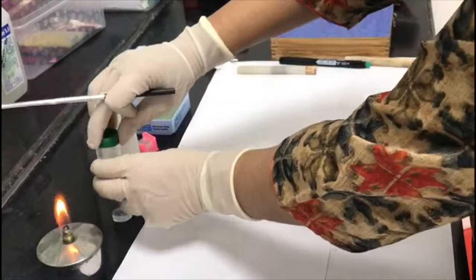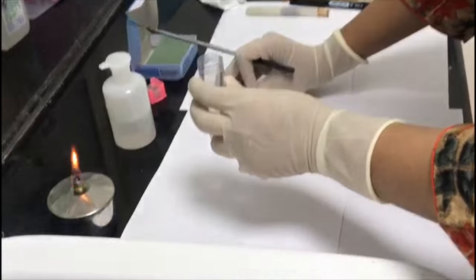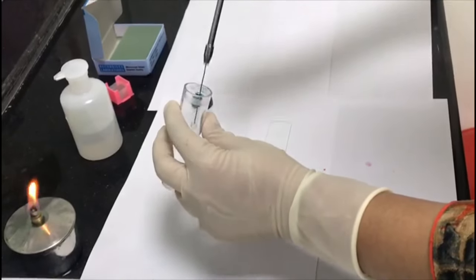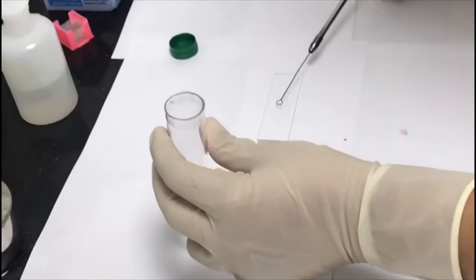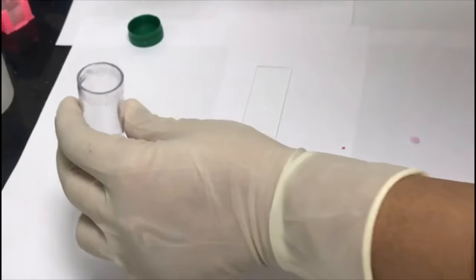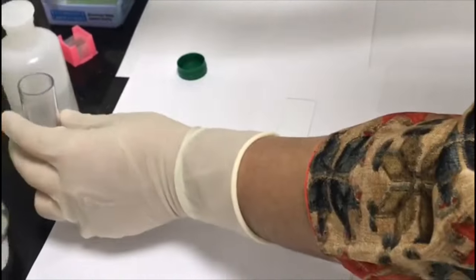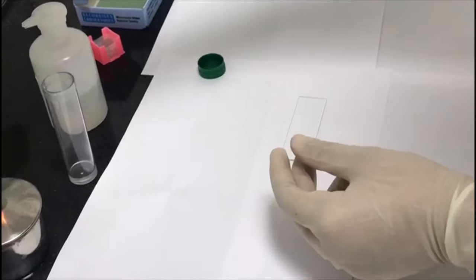Transfer a small quantity of specimen to be examined with the help of the wire loop onto the slide. Again sterilize the inoculating wire loop with the help of the burning flame.